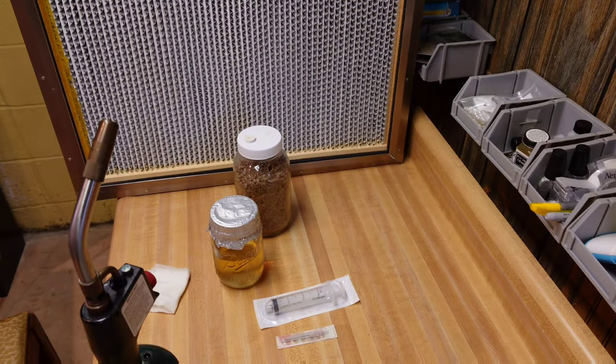Those first seven jars are pretty straightforward — direct inject and you're done, then move them to a storage tote to incubate. Now on to the interesting part. First thing I'm going to do is shake up that grain jar to break up all that mycelium, which will help our liquid culture pick up a ton of little mycelium fragments along with all those other goodies in there.